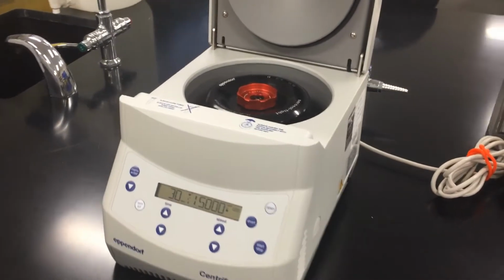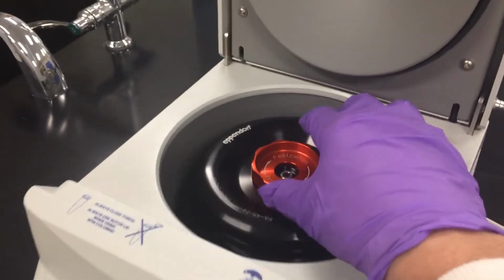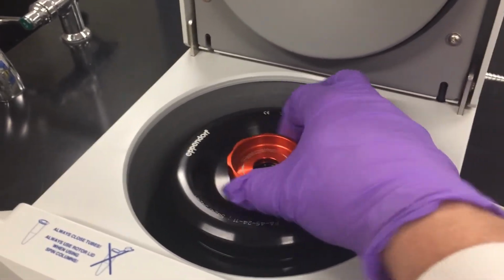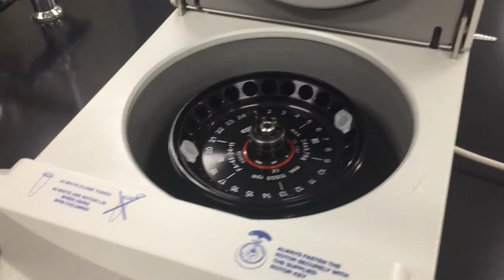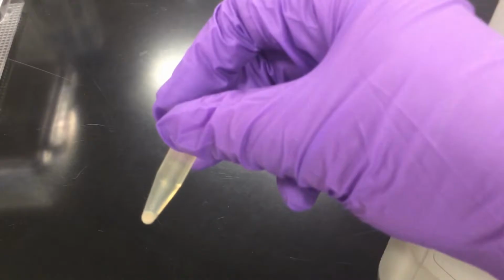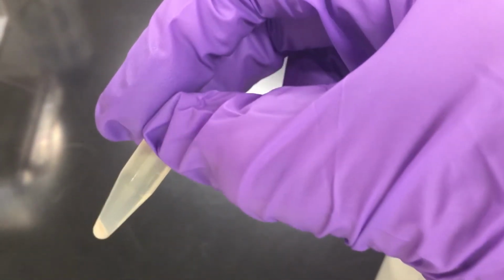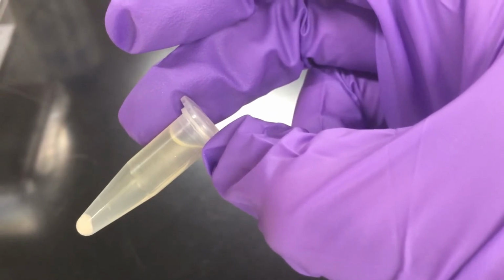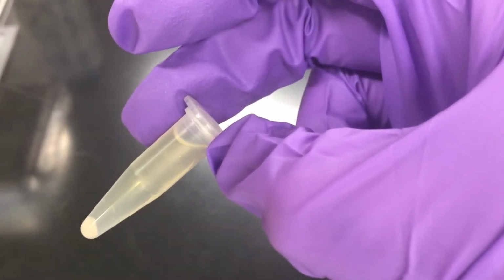I repeated the first part of the procedure a few times, so I added more culture, spun it down, so I think I've done it about 5 times. And let's take a look and see if we have a larger pellet now. And yeah, you can see that's a lot better. We have a larger pellet of E. coli. So what I'm going to do now is basically remove the liquid supernatant before proceeding to the next step.